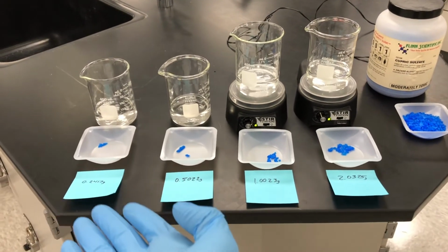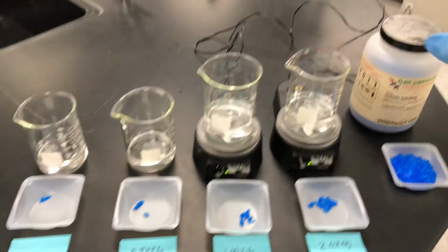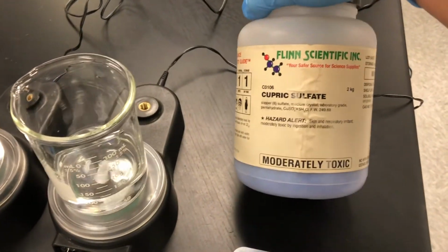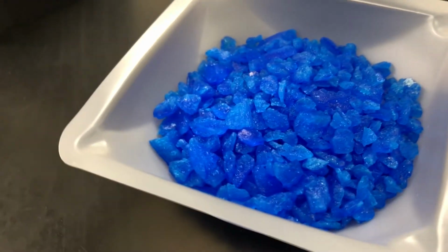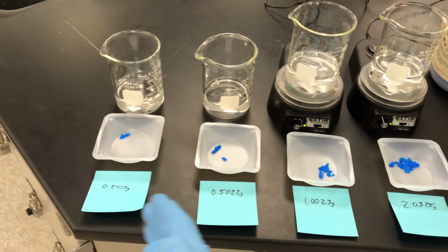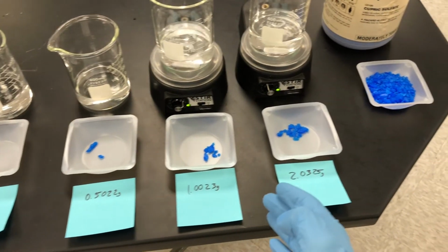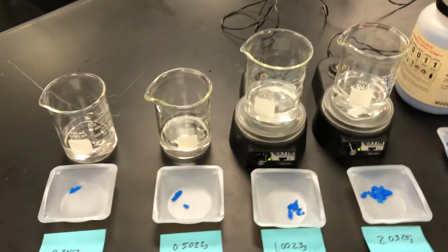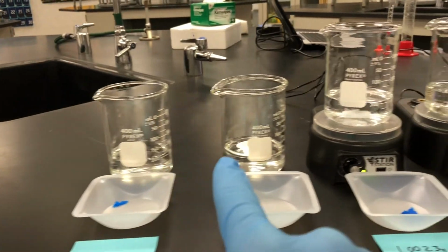So as you guys can see, I've already measured out 4 different masses of the copper sulfate, which is this solid right here. And if you look closely, it's this super pretty blue crystal. So it looks really awesome. What I've done so far is I've gotten 4 different measurements of masses. So I got about 0.24 grams, 0.5 grams, 1 gram, and a little over 2 grams. So what I'm going to do is I'm going to add these to our water, and each of these is measured out to 100 milliliters.